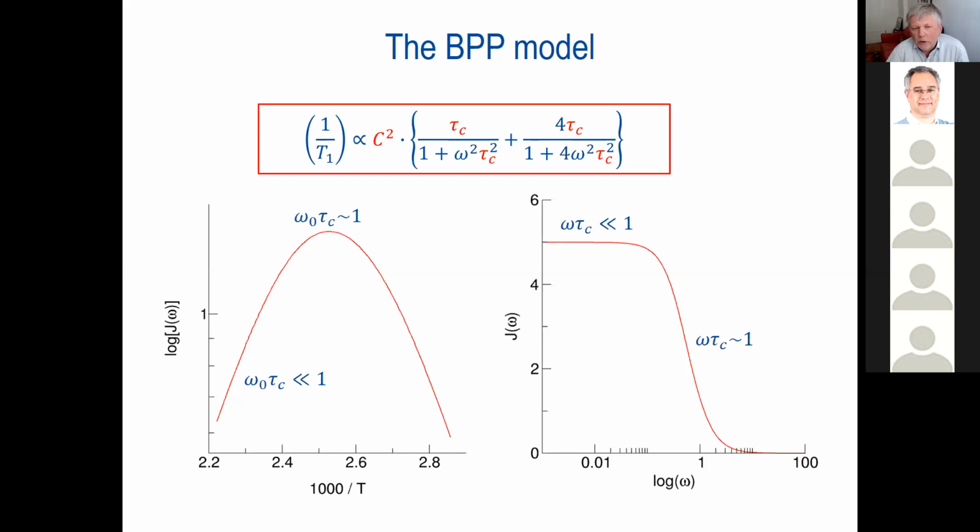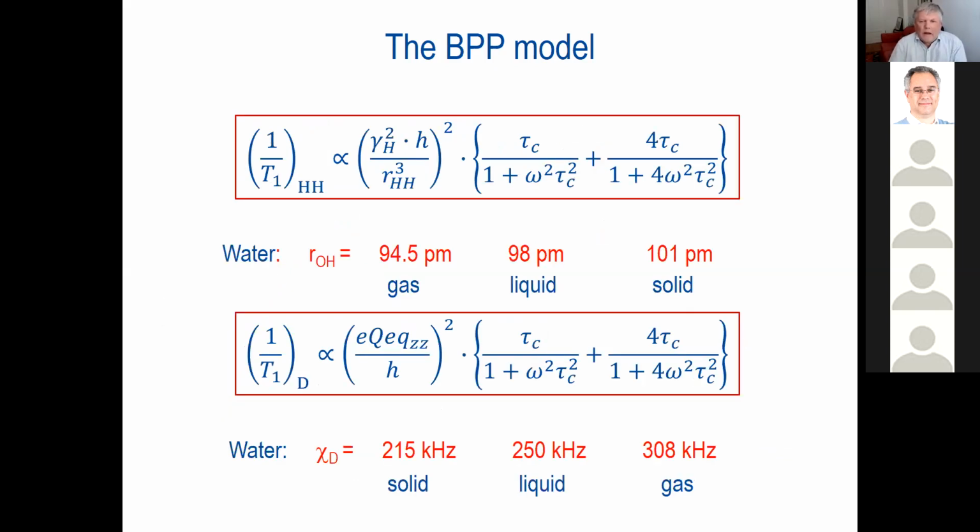And then we are also able to get some information about the dynamics, but also about the coupling parameters, which is simply called C in this particular case. And this coupling parameter is always very important. And if something doesn't fit, people tend to move all the problems into this coupling parameter, but not discussing the proper value of the coupling parameter. I will show you how that can happen later on. Another thing may be of interest to you as well, if we come later on to real systems and relaxometry.